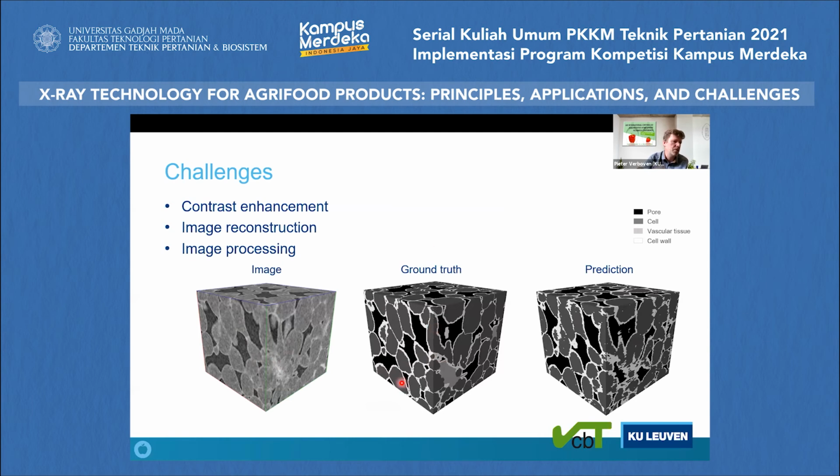It uses a lot of manual intervention, sometimes days of work to interpret such an image. We are now working on doing this in an optimized way. So we have models available that can directly translate the raw image into the image that we want for further processing. There are a lot of benefits, and we have several PhD students working on trying to optimize these methods. They are there, but there still needs to be work done on it.